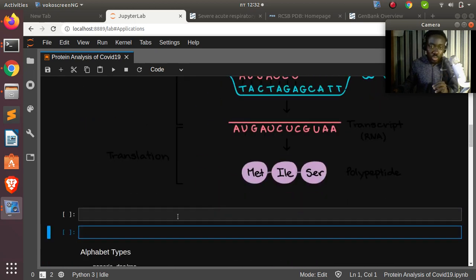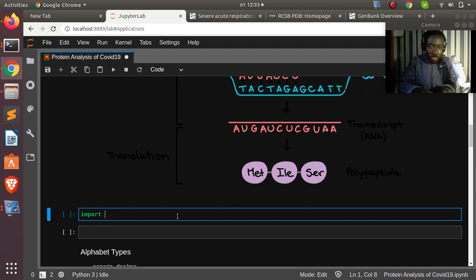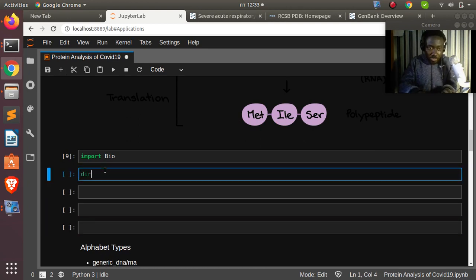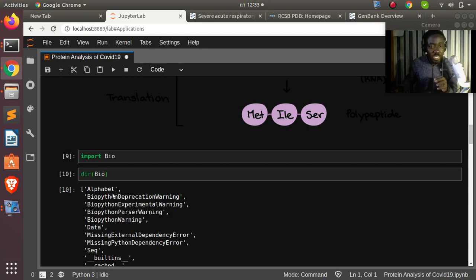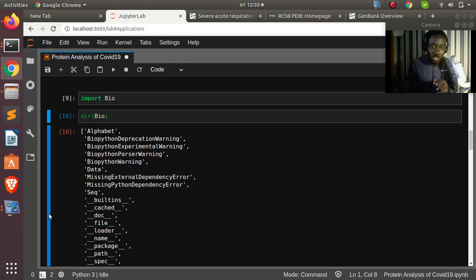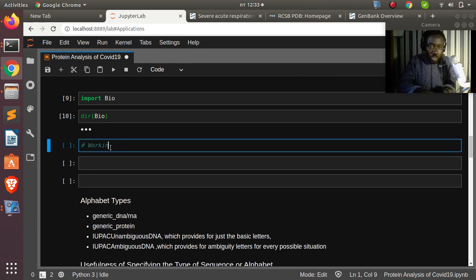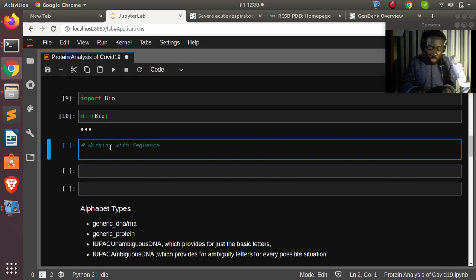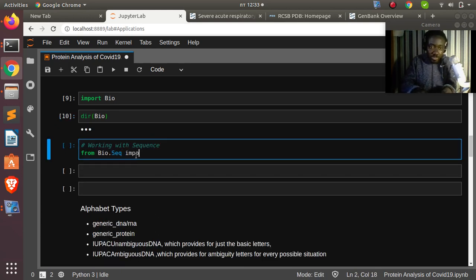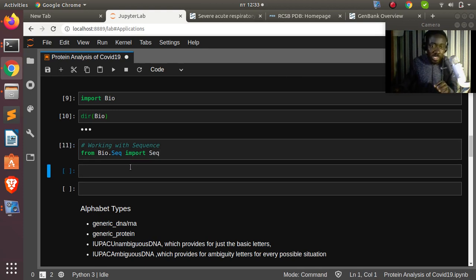Let's start by importing Bio and checking its methods. To work with sequences, we import from Bio.Seq. To create a simple DNA sequence: s = Seq('ATCG...'). If you check dna.alphabet without specifying, it returns 'generic alphabet'. The alphabet specifies the type of sequence — generic DNA, generic RNA, generic protein, or IUPAC unambiguous/ambiguous.